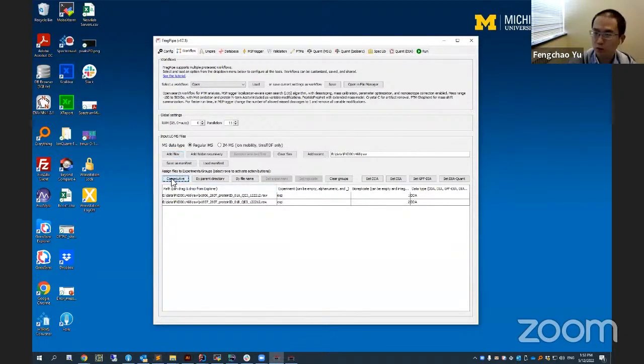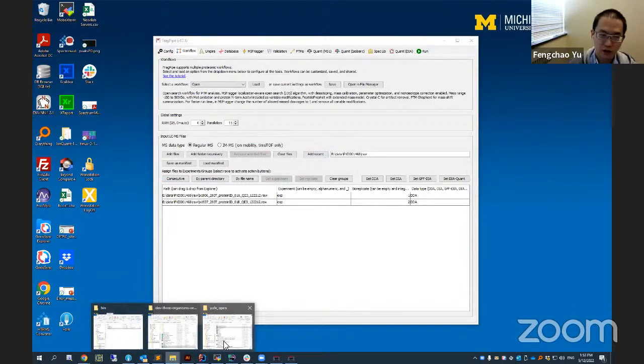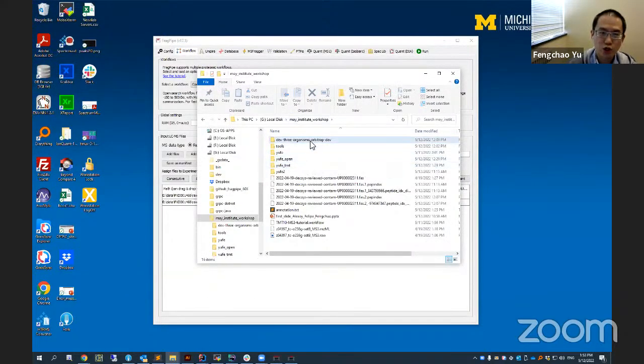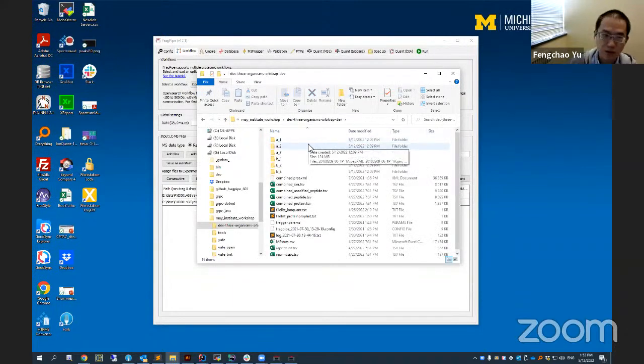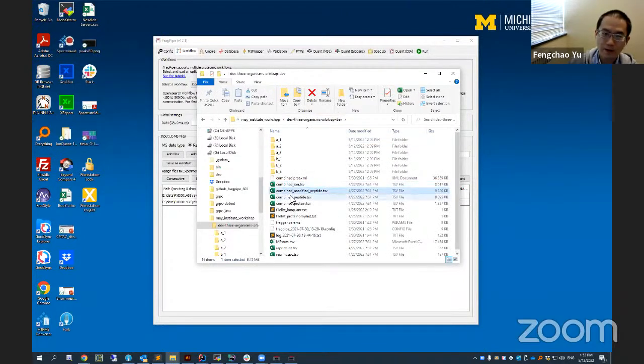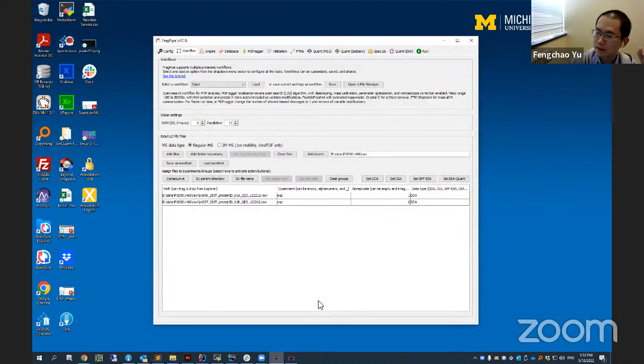If you put them into two different experiments, there will be two folders. Each folder has its own separate TSV. And in the root folder, there will be a combined TSV folder, like I show here. I have 6 experiments. Each experiment folder has its own TSV files here, and then outside, there is a combined TSV folder. So the number of TSV files and how the data is organized in them really depends on the experiment structure you specify here.